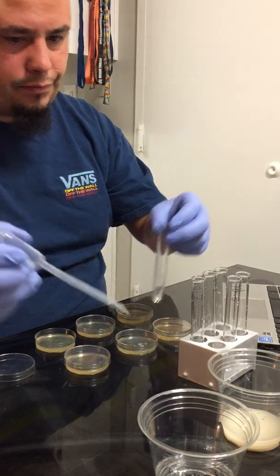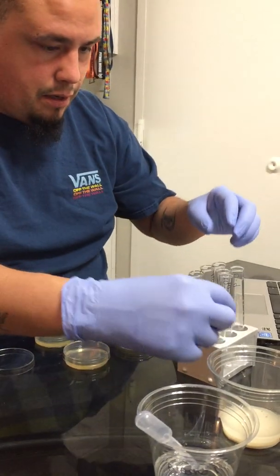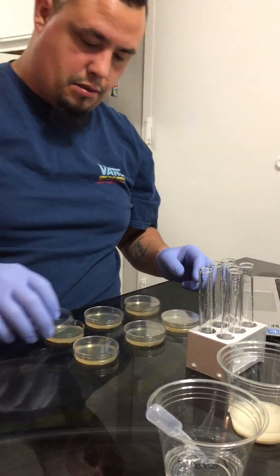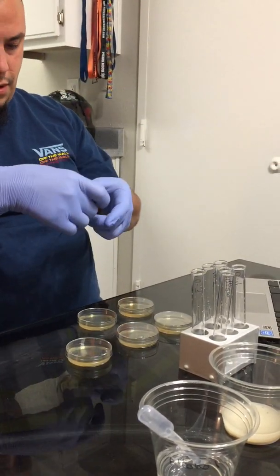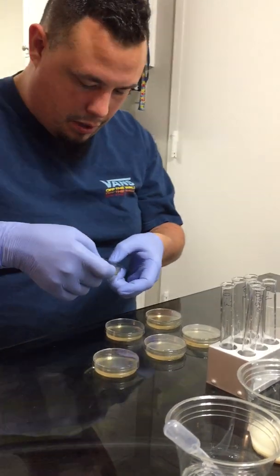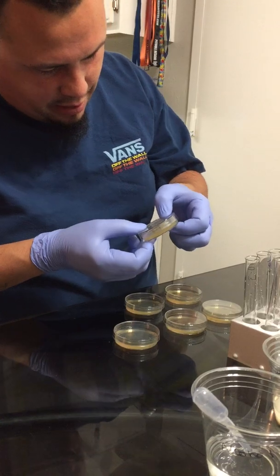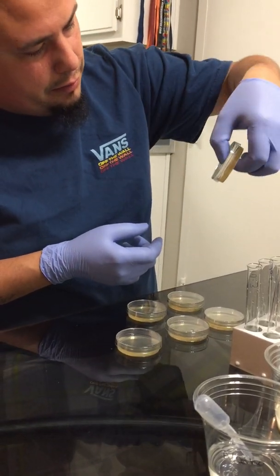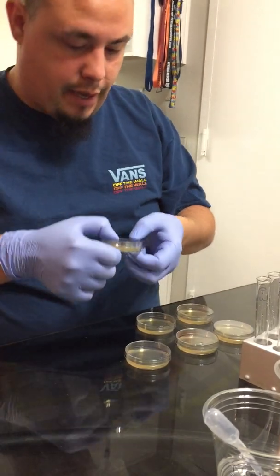Perfect. Okay, now we have our plates poured and all of our samples smeared on the agar. So this is the first part of the lab.